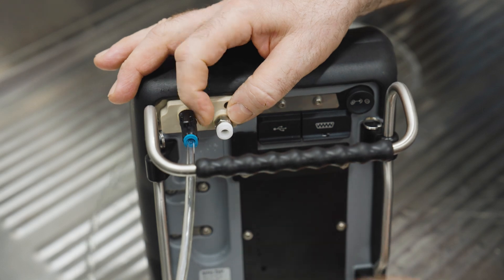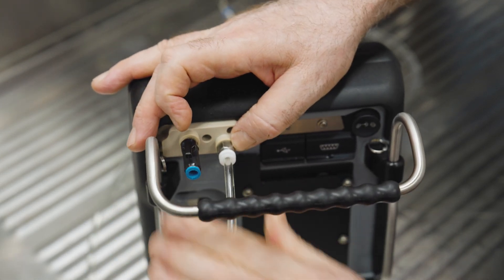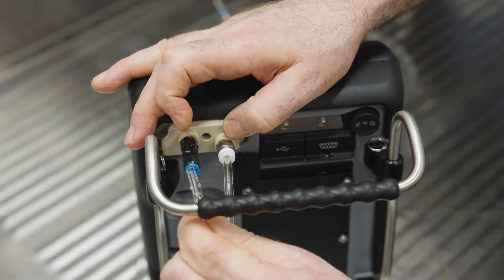If the flow is blocked, clean the filter and perform a back flush. Swap the sample inlet and outlet hoses and repeat the rinsing steps.